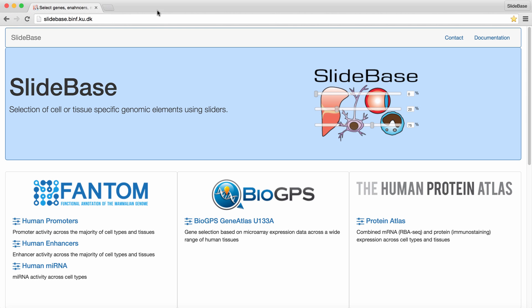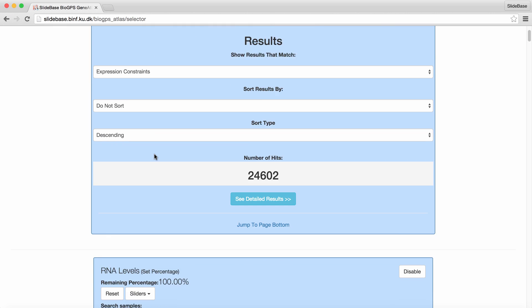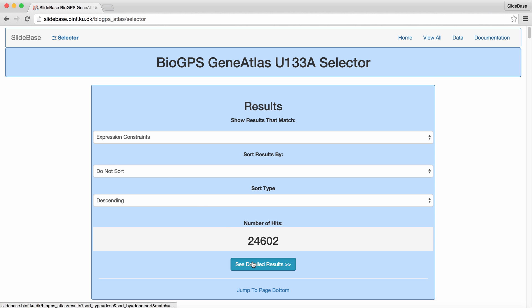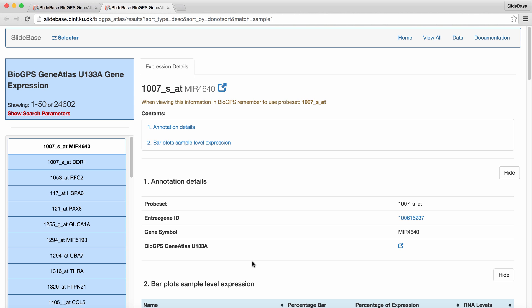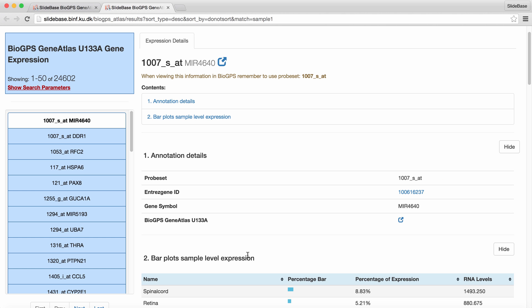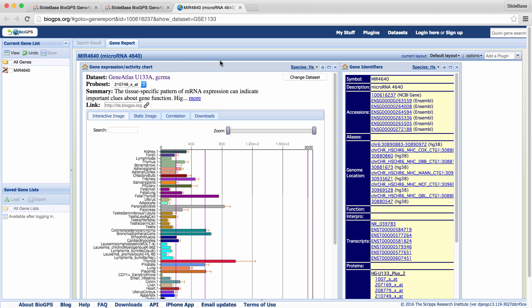Next, we will move on to the Human Gene Selector based on a dataset from BioGPS. The BioGPS Gene Search page is structured in the same way as the Human MicroRNA selector, with the difference being that there is no location-based search. The BioGPS Gene Viewer page displays a list of resulting gene probe set pairs on the left, along with gene expression information on the right. Compared to the Phantom datasets, the BioGPS results page displays less information and offers fewer options, because the emphasis was put on selection of genes rather than displaying data. A great deal of information can be viewed in BioGPS directly, to which we link from each result obtained. The Gene Report page from BioGPS displays detailed information about each gene resulted from our Slidebase search.